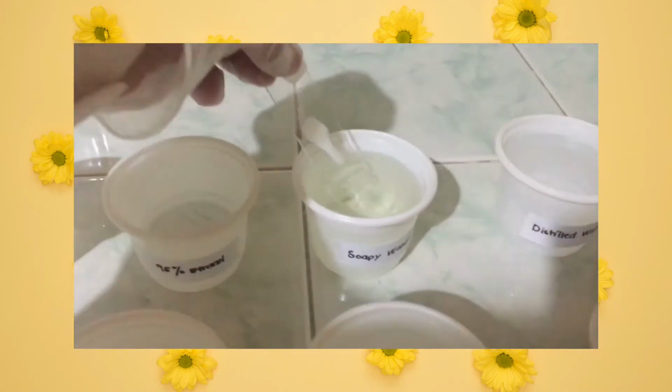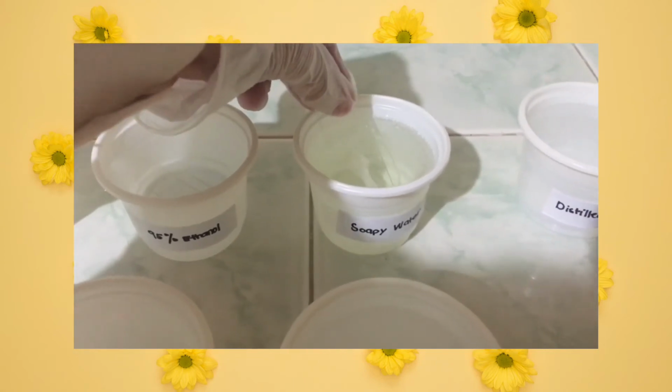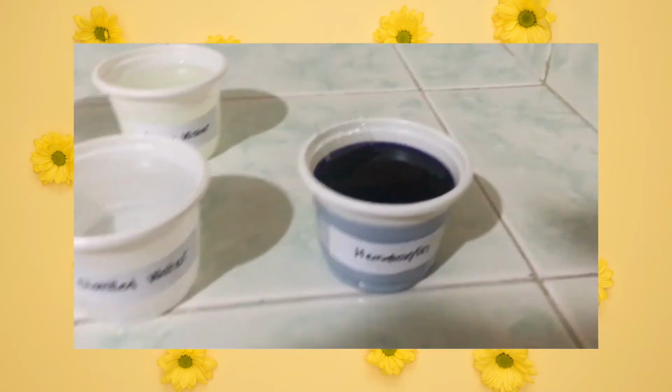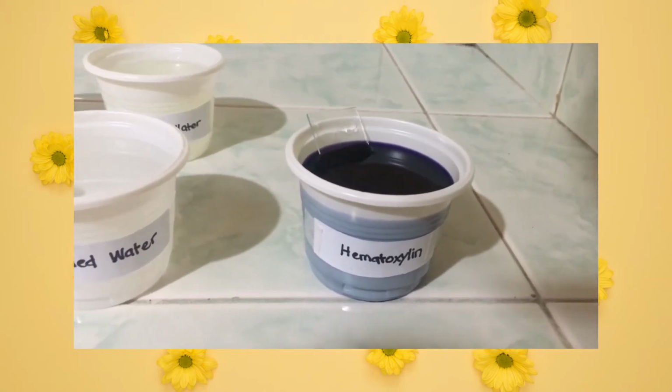Then for the 4th step, wash the slides in soapy water and remove the excess albumin or impurities using a cotton swab. Remember not to touch the tissue sections. Then after this, we can now rinse the slide with the clean water and drain the excess water on paper towels. Then for the 5th procedure, we can now stain the slide in hematoxylin for 5 to 10 minutes.